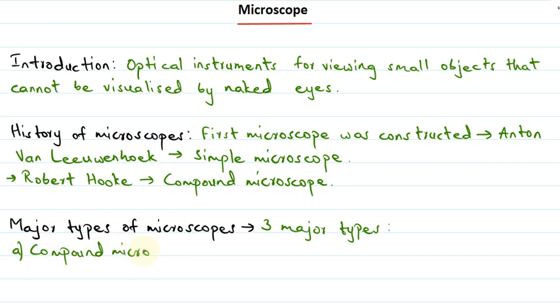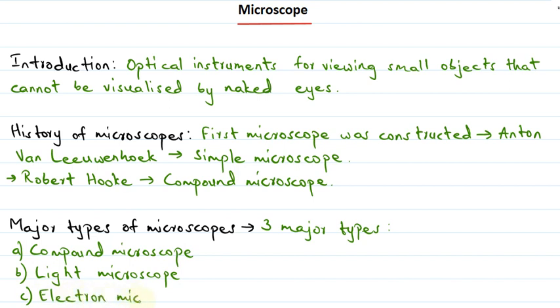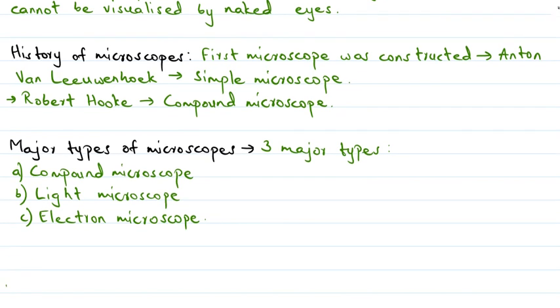Then there is the light microscope, and the other one is the electron microscope. Alright, so we would study about each of them in detail now.